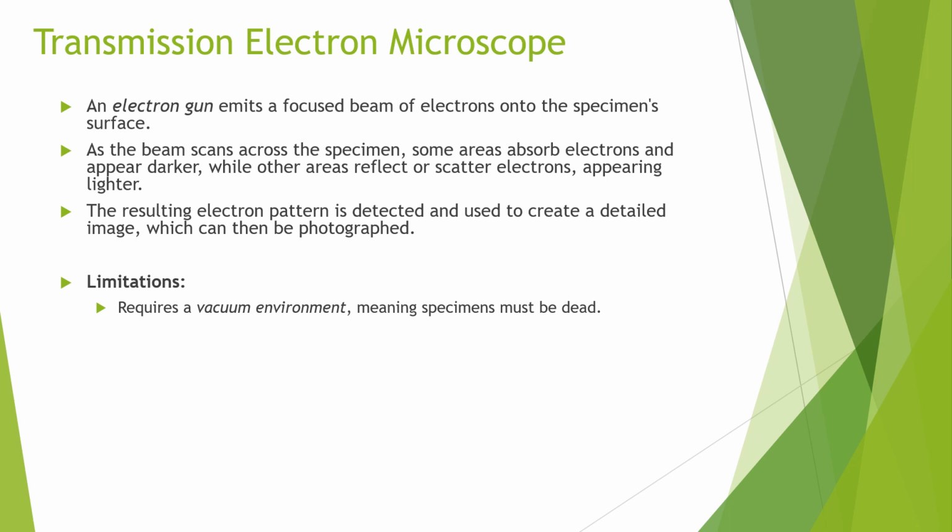Secondly, TEM images are produced in black and white. While this doesn't affect structural details, adding color to TEM images must be done digitally afterwards, allowing scientists to highlight certain structures or areas for better visual understanding.